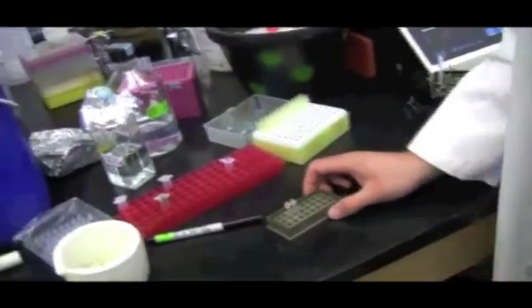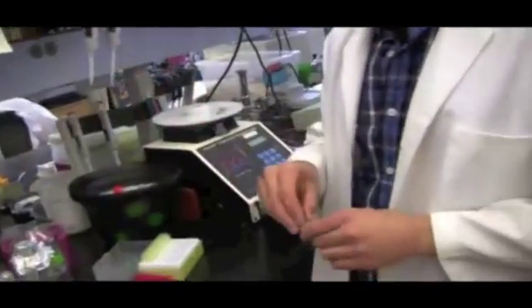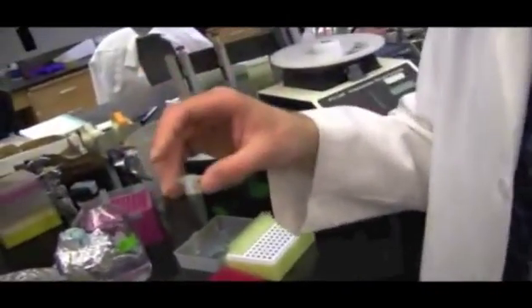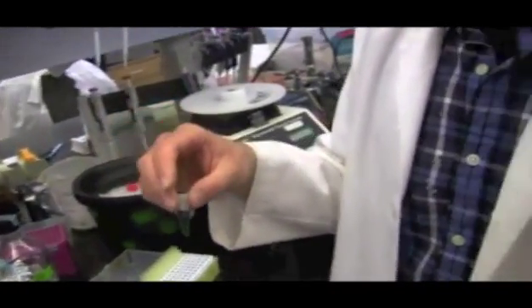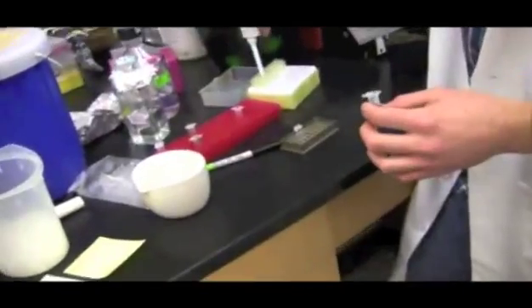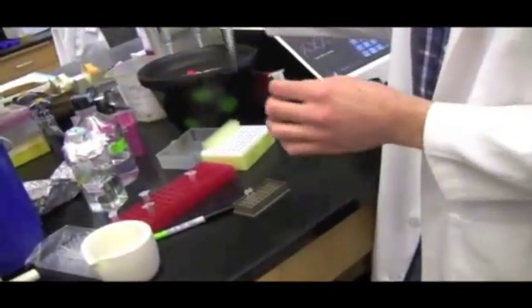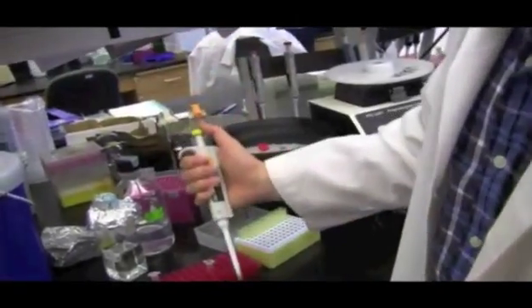Next, like I said, if we're thinking of our copy machine example, we need to add stuff to make copies with. So nucleic acids in this case, that's kind of like adding paper to a copy machine. So there's some of that in here. On top of a little protein, remember earlier I said that proteins are like little machines. So this has a protein that can both read and make new DNA at the same time. And so it makes exact copies of what you put in there. And I need to add some of that. Nice green color.